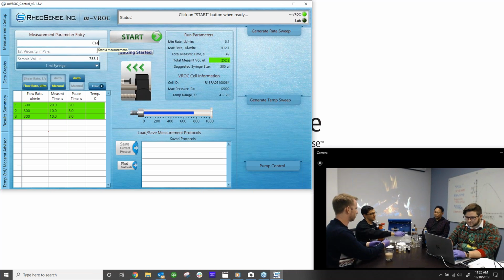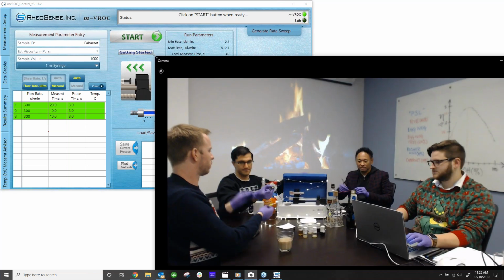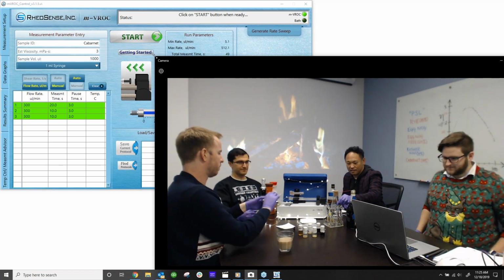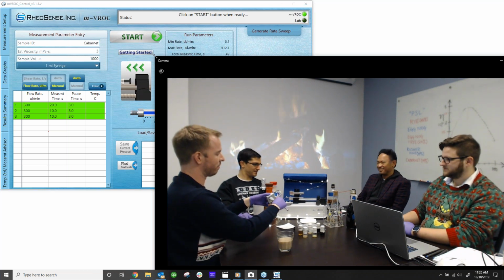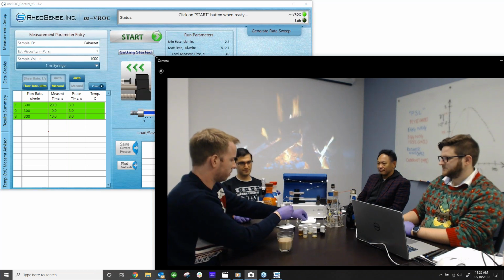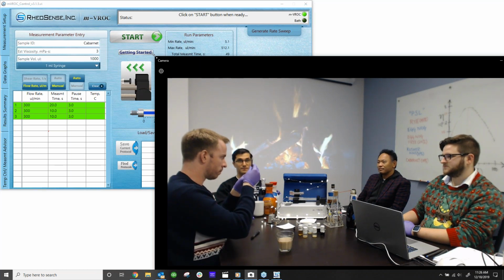You can look at it, right? That bubble in there, I just want to remove that really quick.